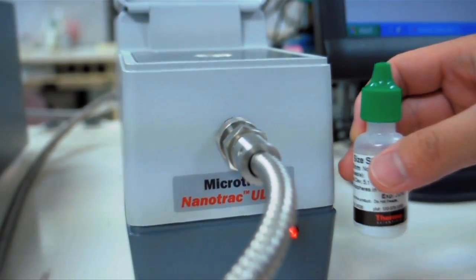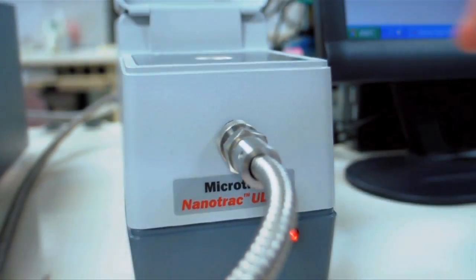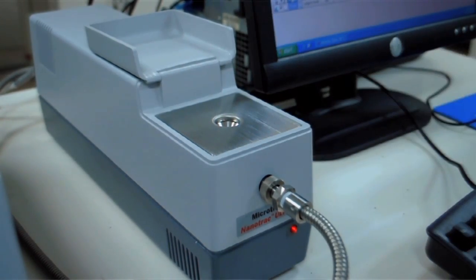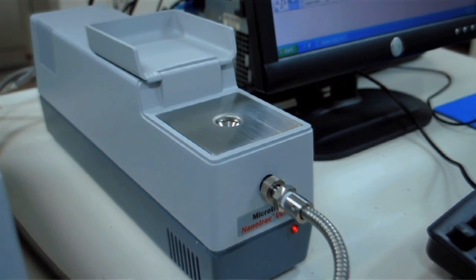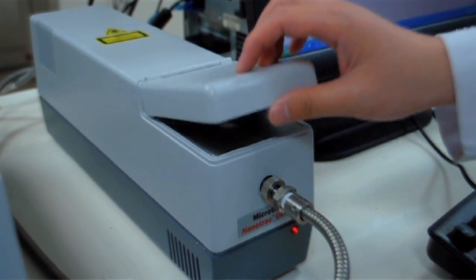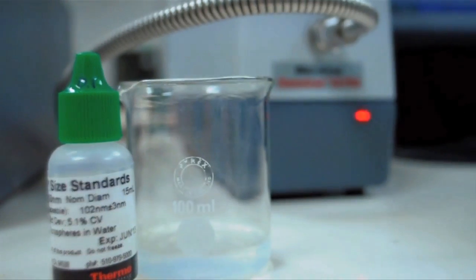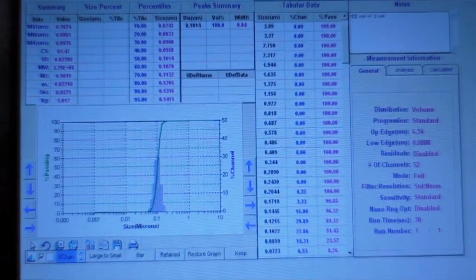Here are some latex standard particles. Simply add a few drops of the sample into the sampling cell, close the cover and click on run. And here are your results.